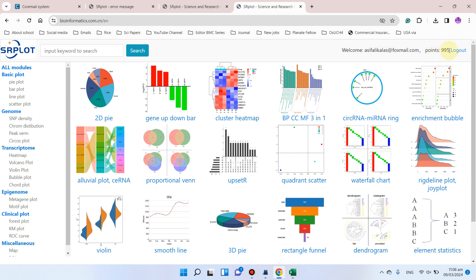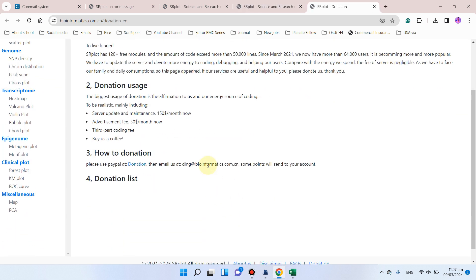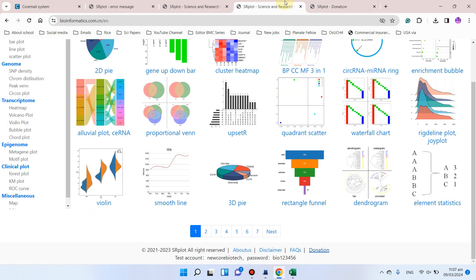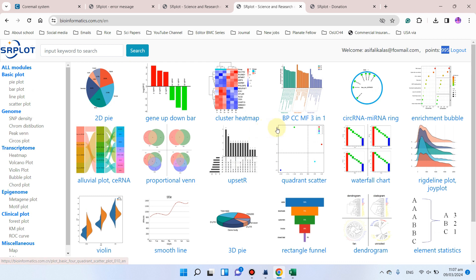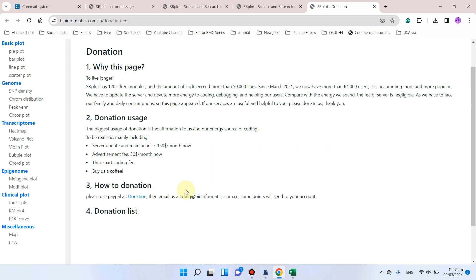The second thing to notice: if your points are zero after login, you need to email this account and ask — 'I am a new user, can you please give me some points?' Hopefully they will give you 50 points for free. Most analyses do not take any points, but a few heavy analyses consume only one point. You can email ding@bioinformatics.com.cn and request points for your research. Even if you cannot donate, no problem — just email and request, and they will give you points for free.